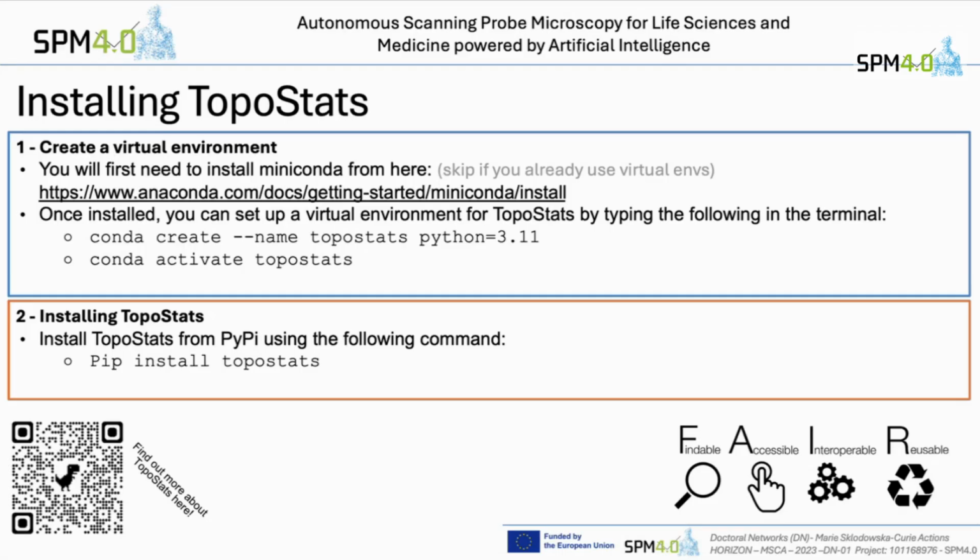Oh, that's weird. It should just go on to install. So yeah, just go there.